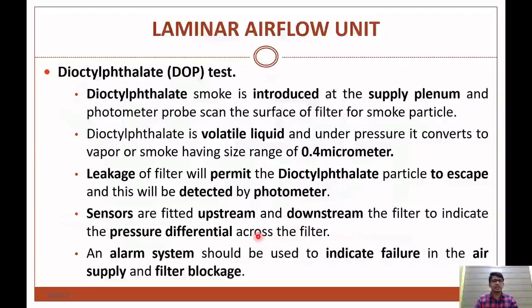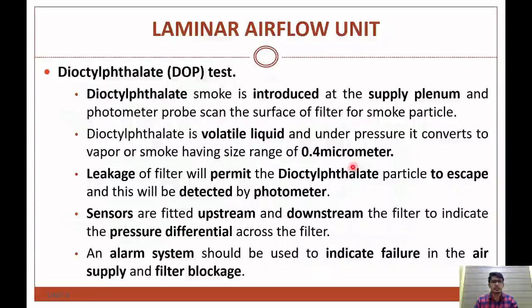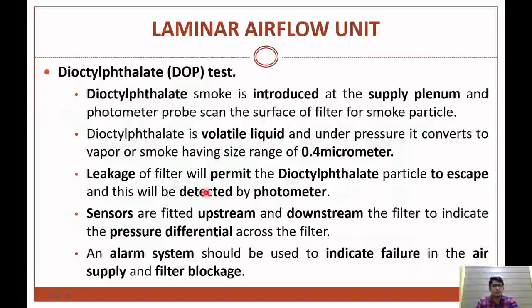For the di-octyl phthalate test, di-octyl phthalate smoke is introduced at the supply plenum and a photometer probe scans the surface of the filter for smoke particles. Di-octyl phthalate is a volatile liquid that under pressure converts to vapour or smoke with a size range of 0.4 micrometer. Leakage in the filter will permit di-octyl phthalate particles to escape, and this will be detected by the photometer. Sensors fitted upstream and downstream of the filter indicate the pressure difference across the filter, and an alarm system indicates failure in air supply or filter blockage.